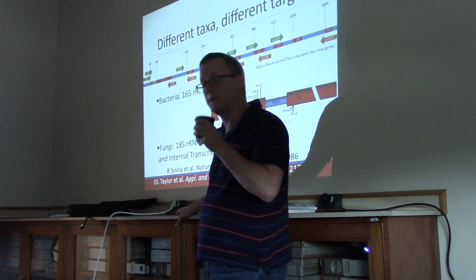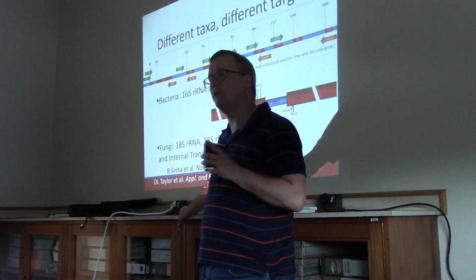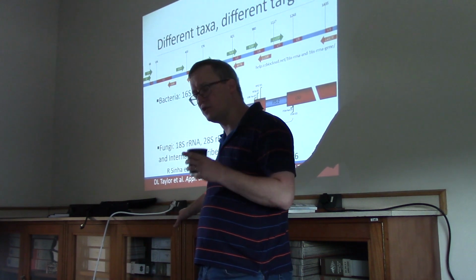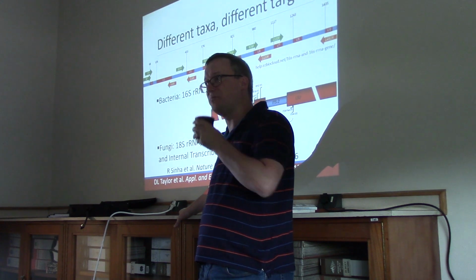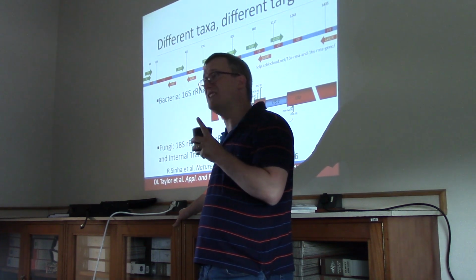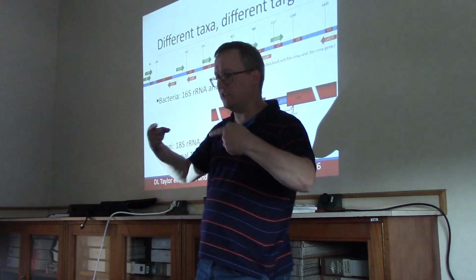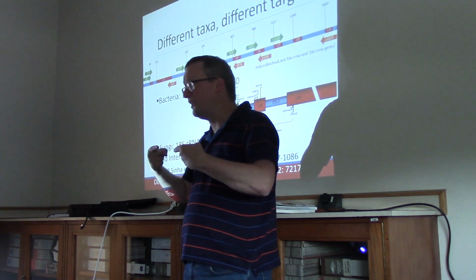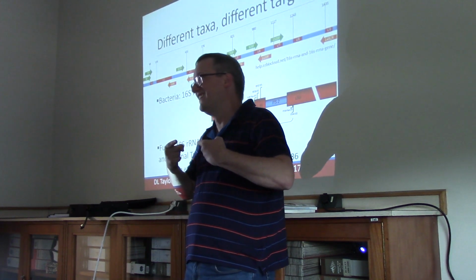Sorry, come again. How will it affect our primer design if we're using a sequencer that generates long reads rather than short ones? This is not a one-size-fits-all operation. If you have a sequencer that's producing reads that are only 40 nucleotides long, your forward and reverse primers need to be really close together.